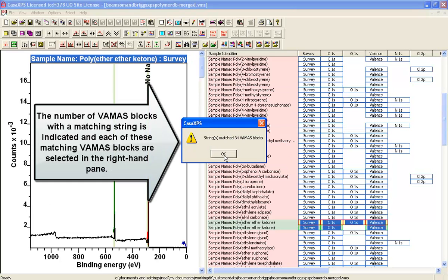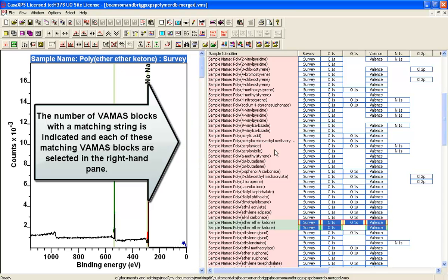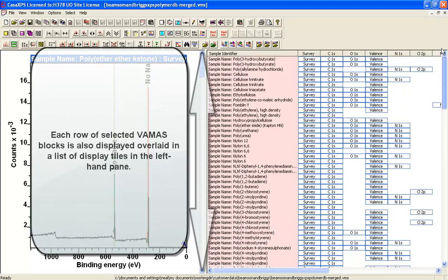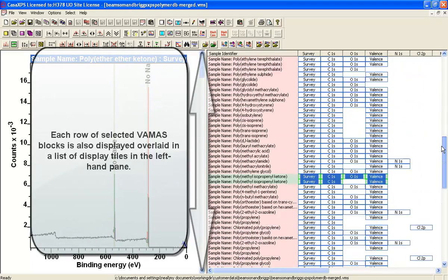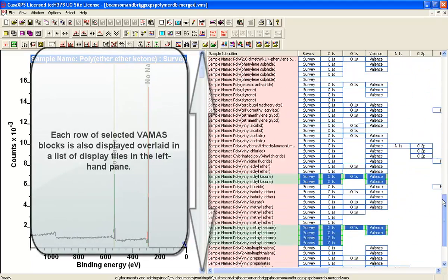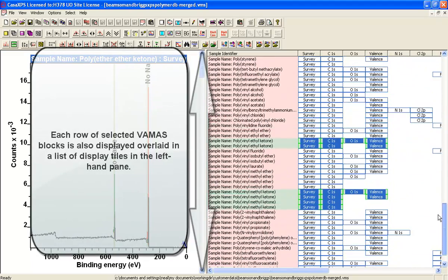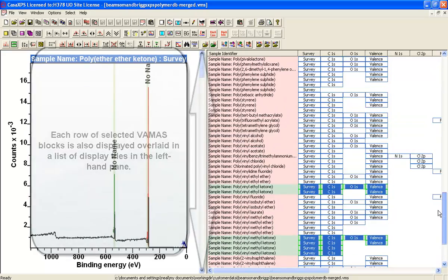And having searched for it I find there are 34 VAMAS blocks that match this so I can scroll up and down and see which ones have been selected on the basis of that search string.